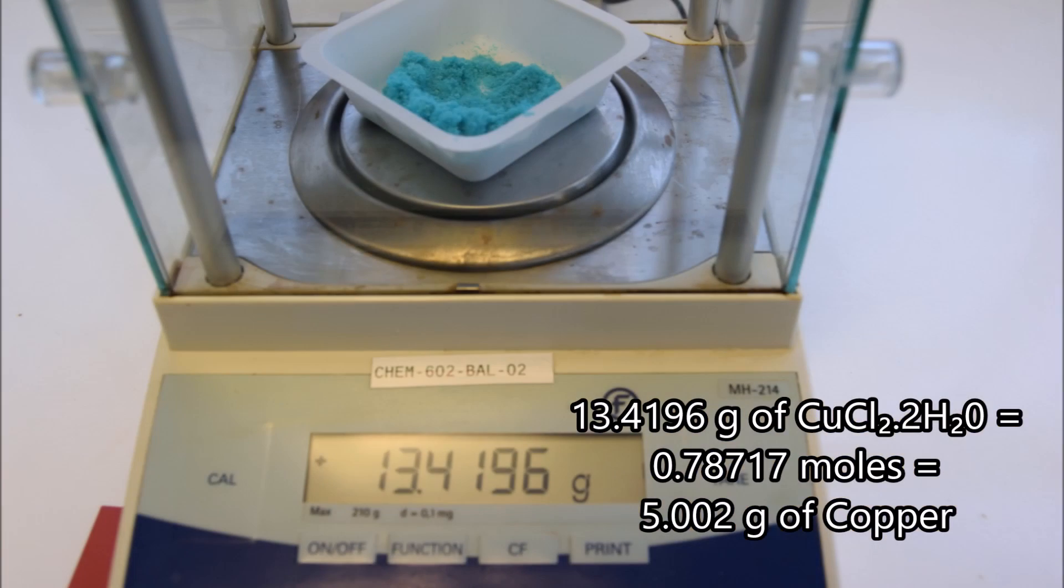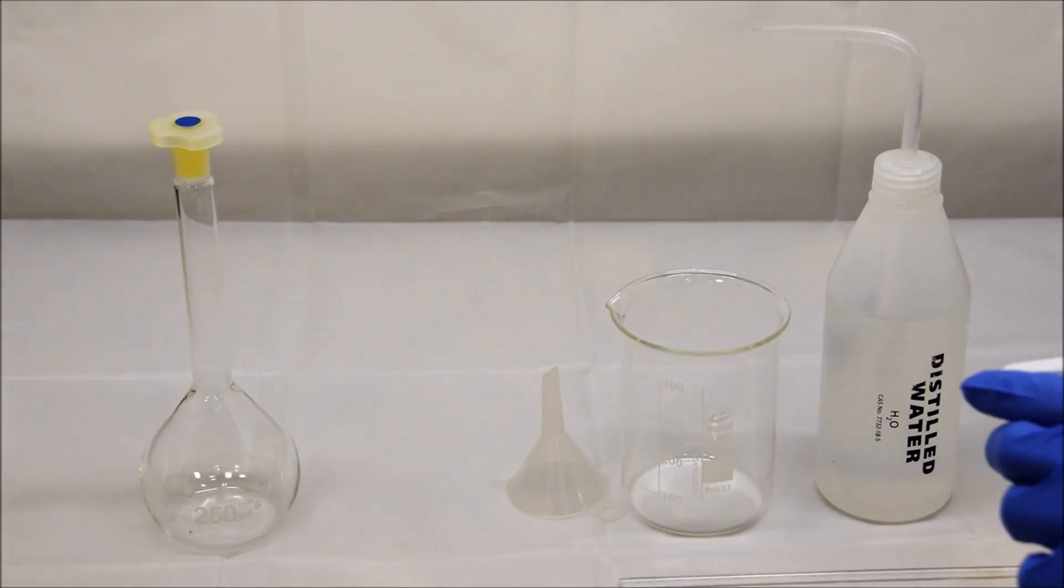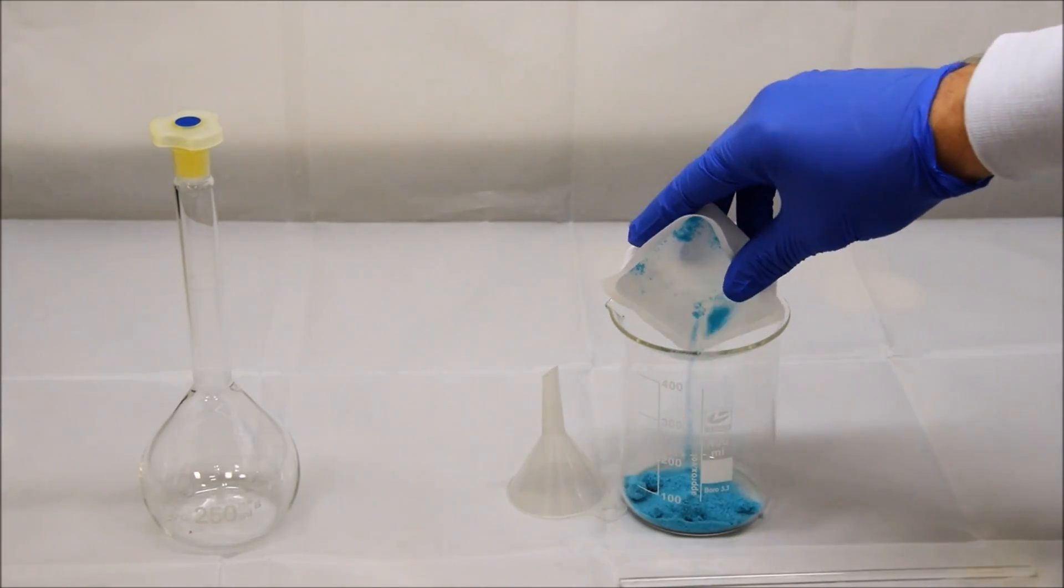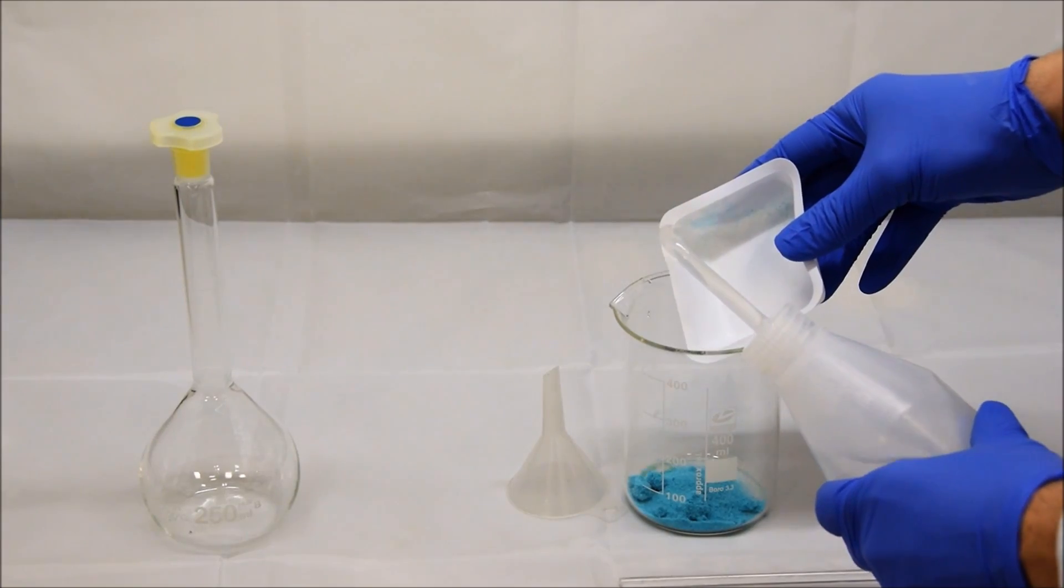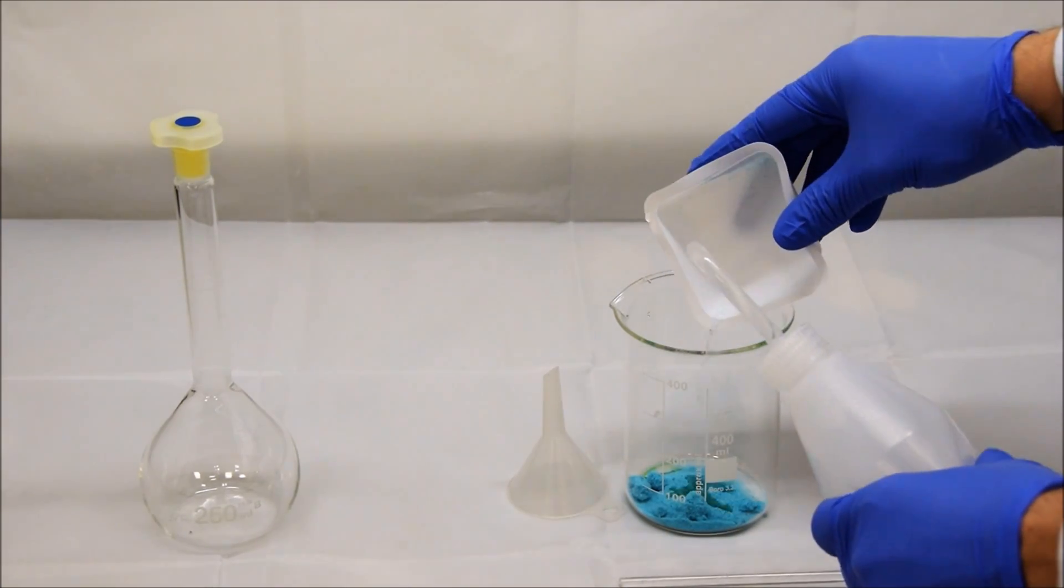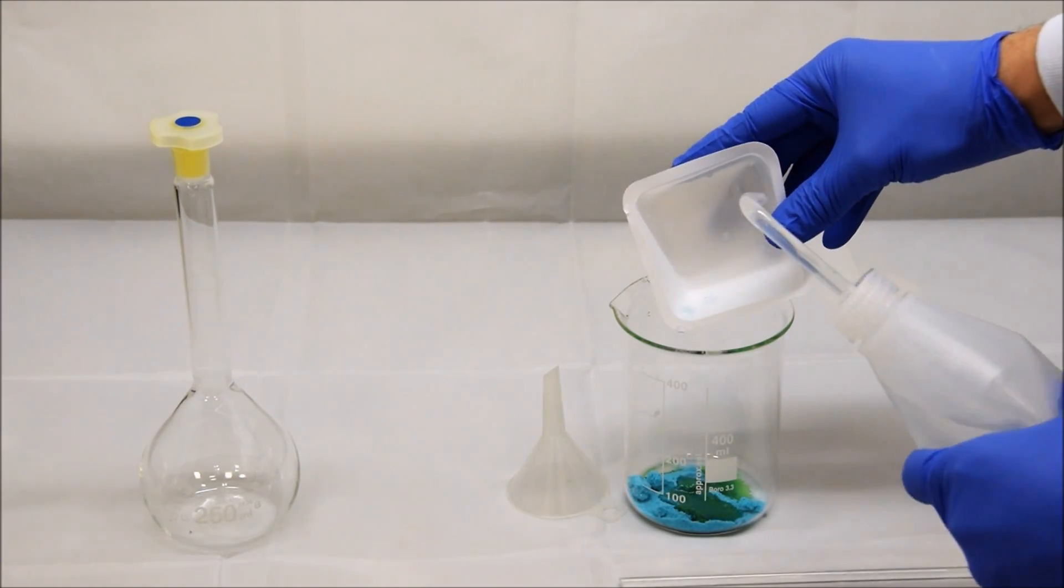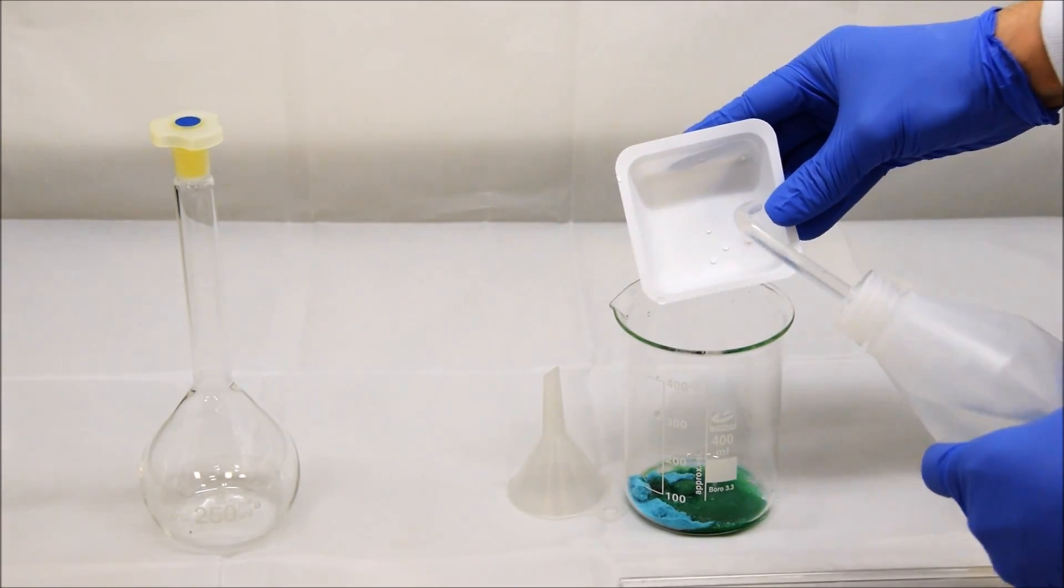So now we have our sample prepared, we need to prepare some standards to measure it against. To do that, we weigh out exactly a known amount of copper. In our case, we're going to use copper chloride and we're going to weigh out 13.4196 grams. If we know what the molecular formula is, we can work out exactly how much copper that corresponds to. So to do that, again, we do the same quantitative transfer. This time there's slightly more steps in it. We transfer it from the weigh boat, carefully washing it out so that it's all into the beaker, and then once we have it in the beaker, what we're going to do is we're going to add in sufficient liquid to dissolve it, so that it's easier to transfer into the volumetric flask.